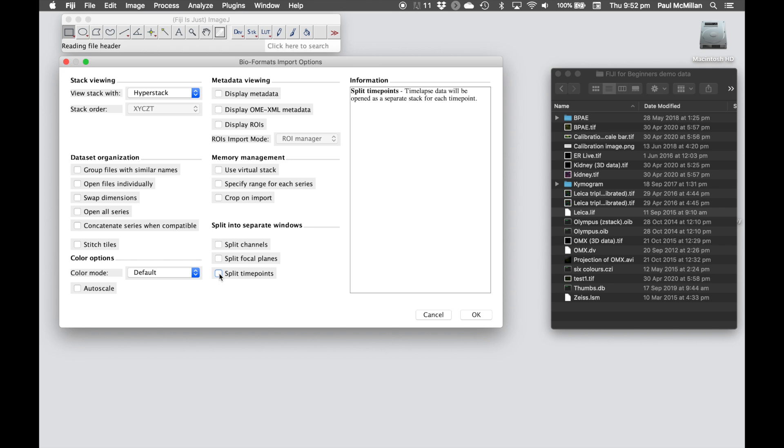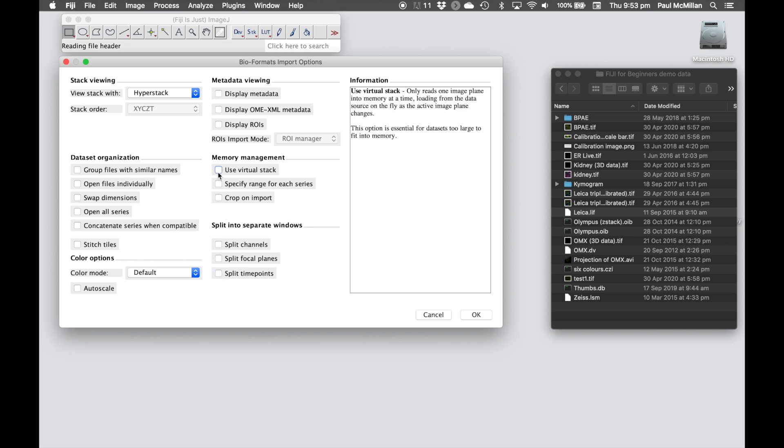Some other things to bear in mind: if you have very large datasets, obviously you might not be able to load in tens of gigabytes into the RAM on the system. You can use the virtual stack option, in which case it only opens up the image plane that we're currently looking at.